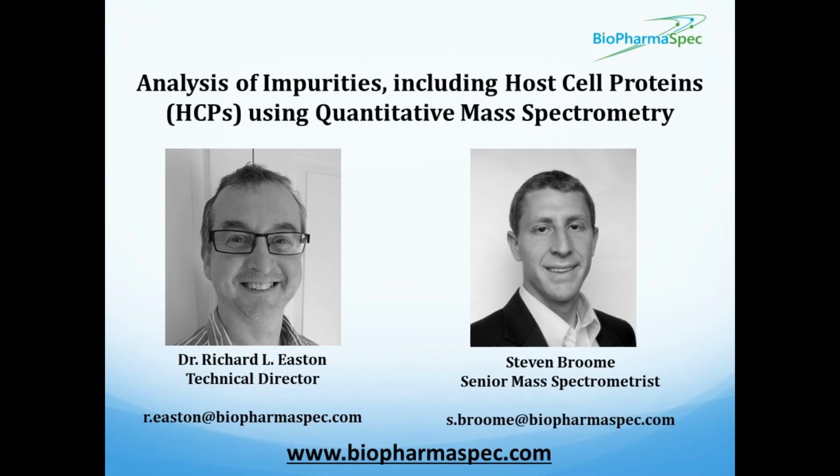So in summary, we see mass spec and ELISA both as crucial to the process of analyzing host cell proteins, and we think they're complementary to each other too. So we suggest doing both tests to really get a good idea of what your impurities are. Right, sure. Okay, so they're very much orthogonal techniques, one used to support and expand the other.